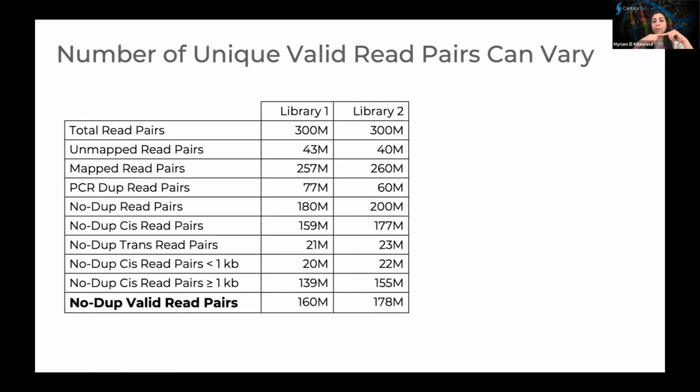So you're cutting the fragments and then it ligates in that same position. Read pairs that ligate more than 1 kb, these are your proximity ligated fragments that are coming from ligating fragments that were co-localized in the 3D space.